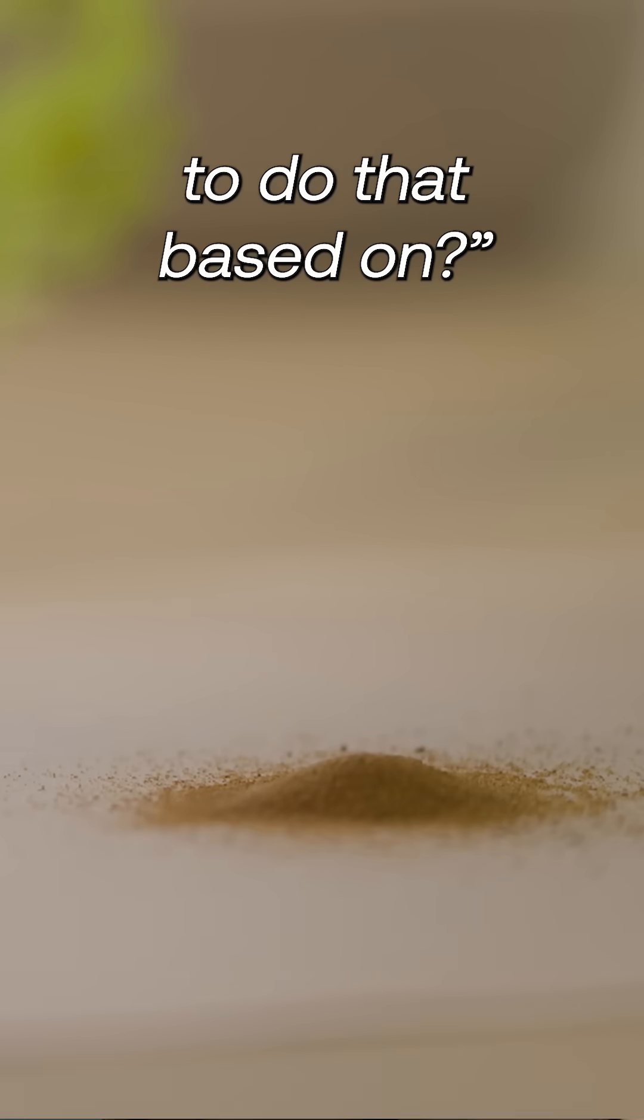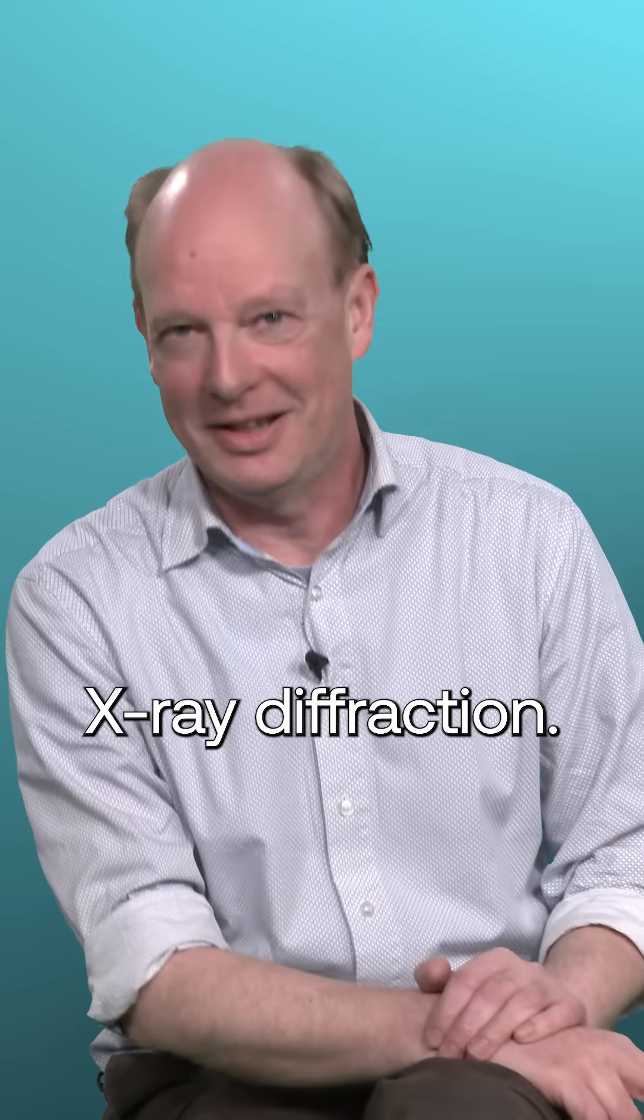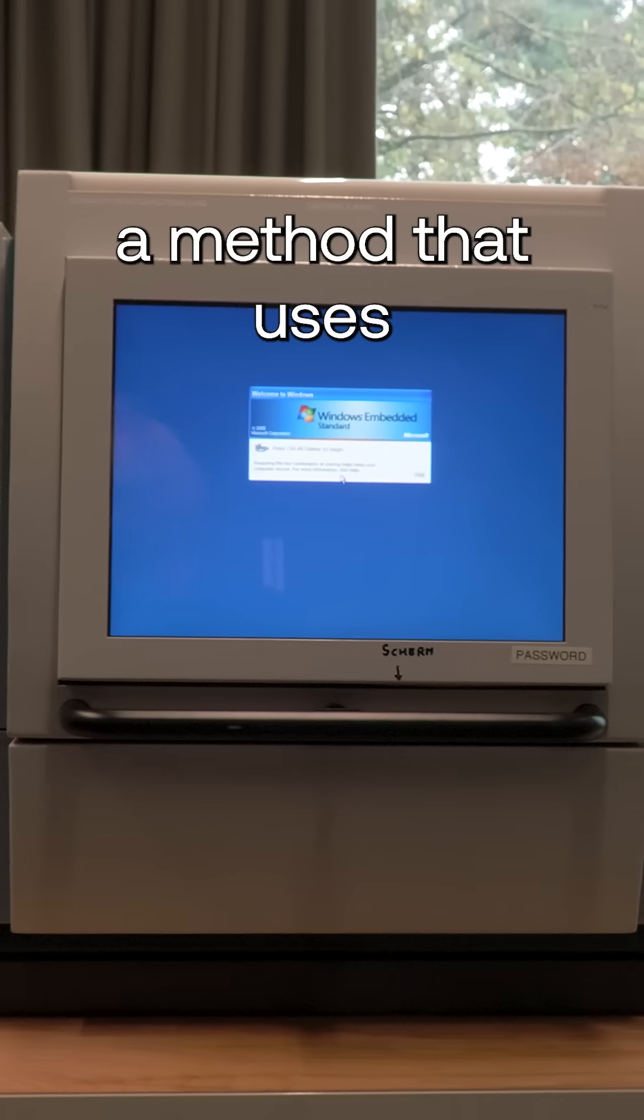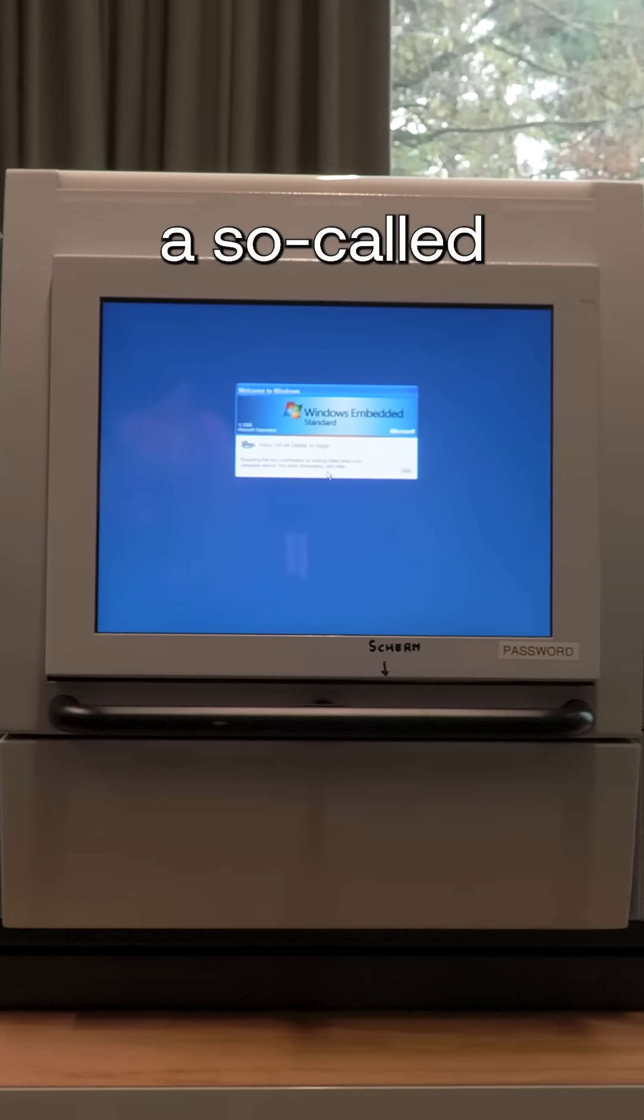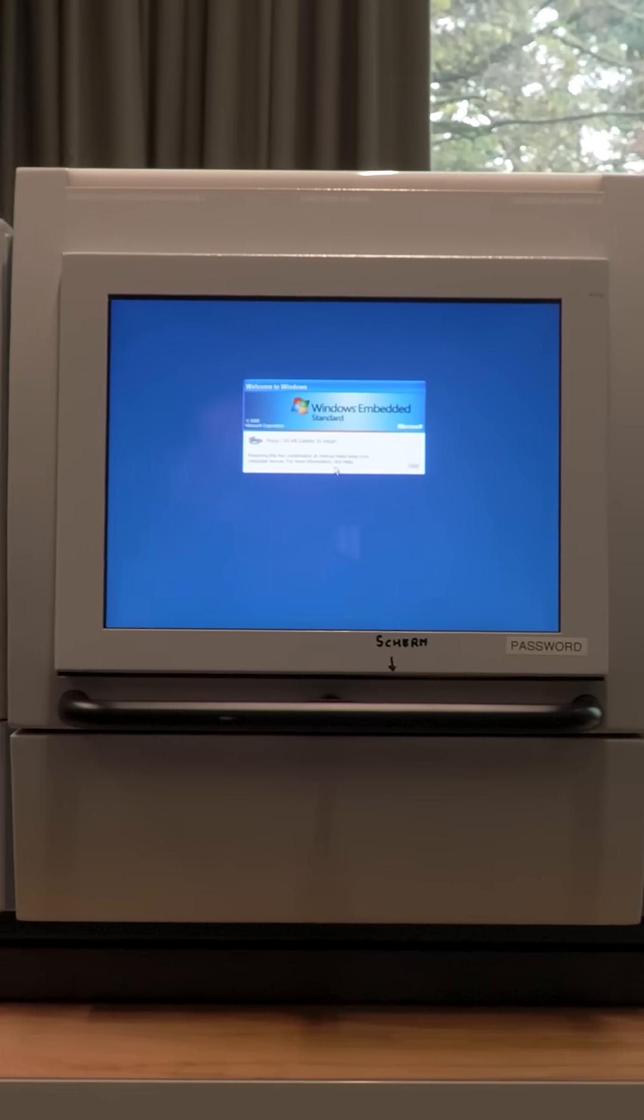What are you going to do that based on? X-ray diffraction. A method that uses a so-called XRD scanner.